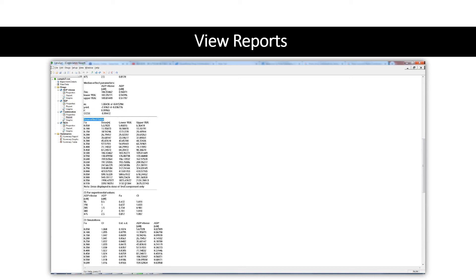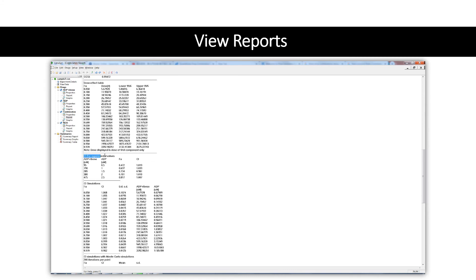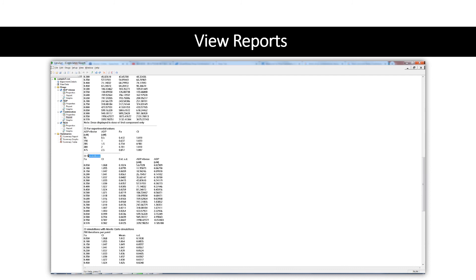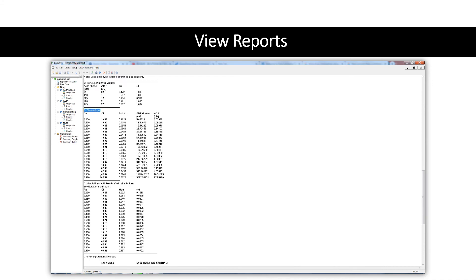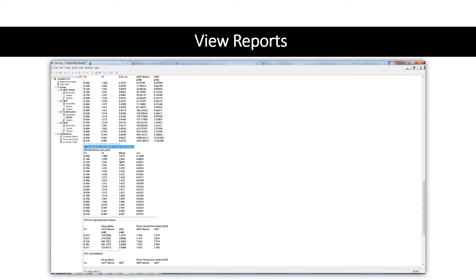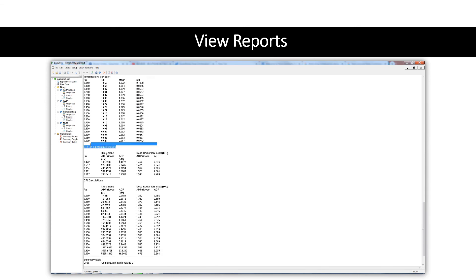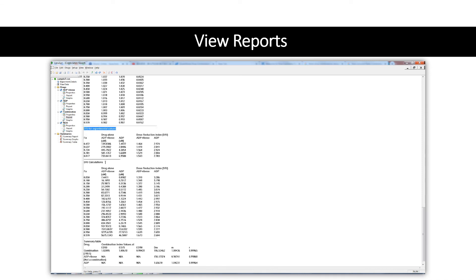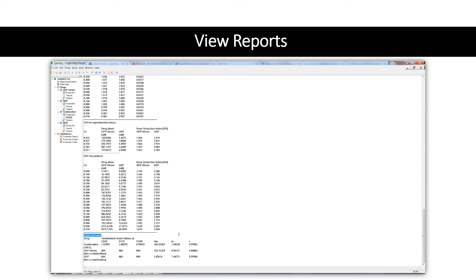The CI for experimental values shows the combination index value for each entered data point. CI simulations give the combination index estimated for each effect value in the table, with the range of effect values set in the reporting options dialog. If the Monte Carlo option is selected, the mean and standard deviation values of CI calculated using the Monte Carlo algorithm are displayed. If the display DRI values option is set, the dose reduction index values will be calculated for a range of effect values. Finally, the summary table gives a one-line summary of the drug parameters for each component and for the combination drug.